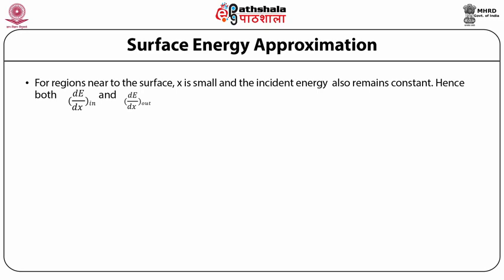In the surface energy approximation, for regions near the surface x is small and the incident energy also remains constant. Hence, both dE/dx and ε at inward and outward paths are taken at energy E0.